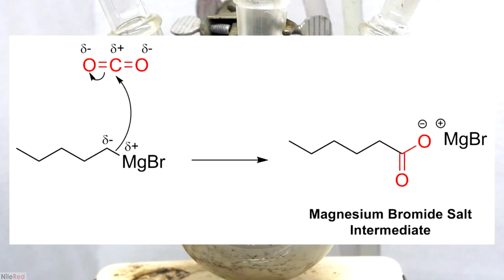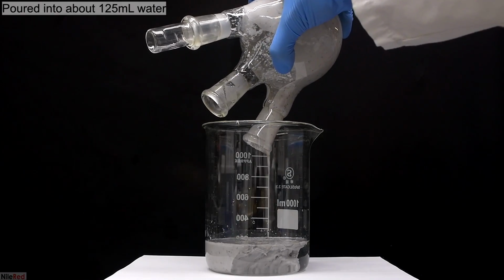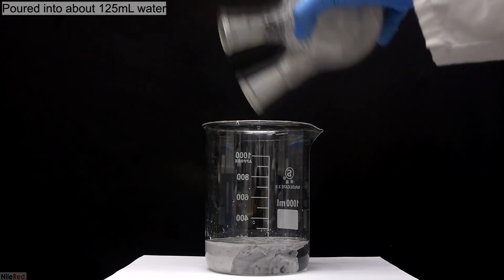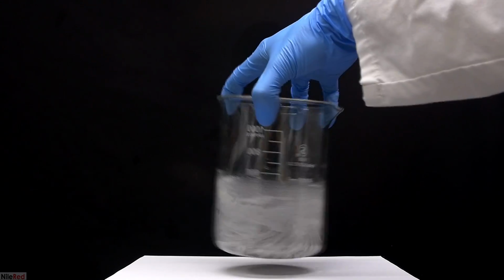When the CO2 is added to the reaction mixture, the electron-rich carbon in the Grignard reagent will attack the electron-poor carbon in the CO2 and form a bond. This will give rise to our magnesium bromide salt intermediate, which will be converted to caproic acid in the workup. The contents of the reaction flask are poured into about 125 milliliters of water. I mix things around a little, but we're kind of left with a mess.